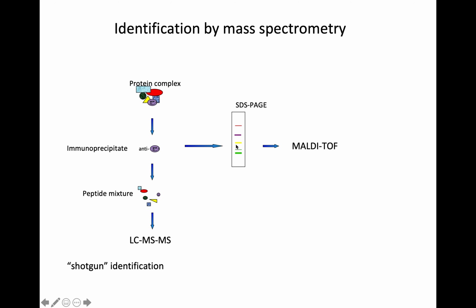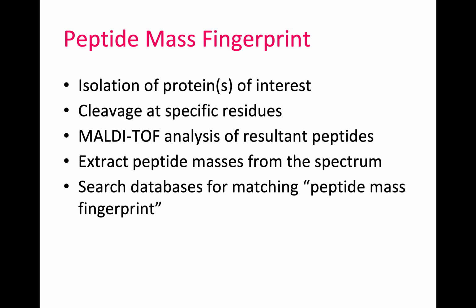You just run it on your 1D gel from your SDS-PAGE, and proceed with MALDI-TOF, or you can proceed with 2D, either 1D or 2D, and then MALDI-TOF. This would be very specific and, like I said, very expensive, because for MALDI-TOF you use a specialized plate and all the chemicals are expensive. So let's have a look at peptide mass fingerprint. What is it? Remember, it's not PMS.